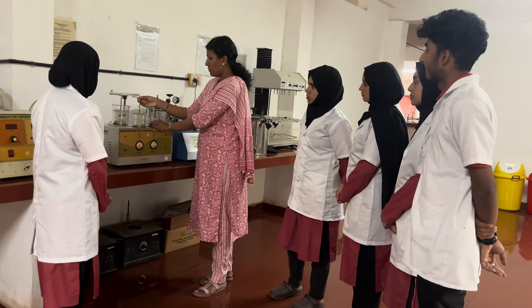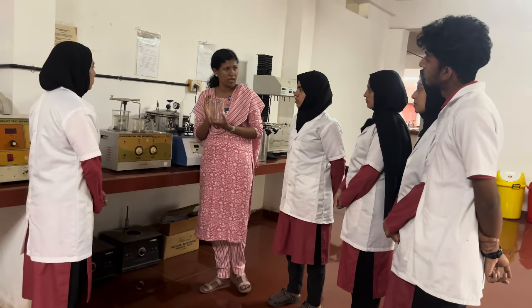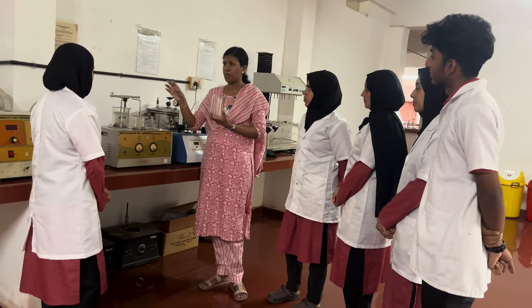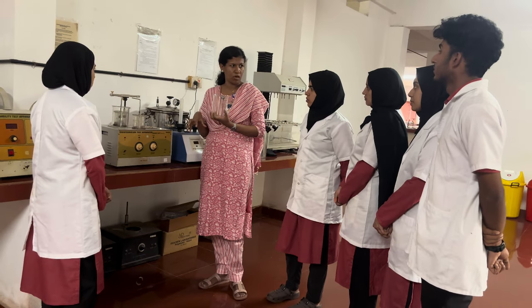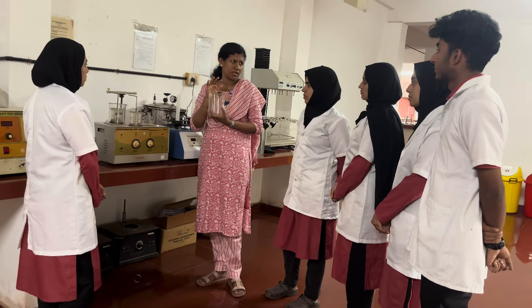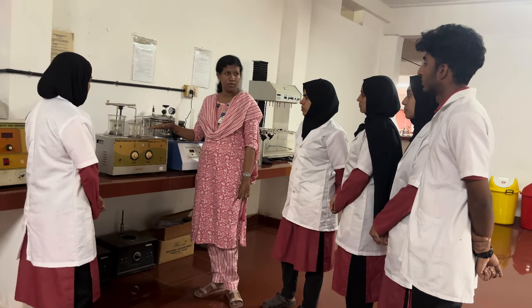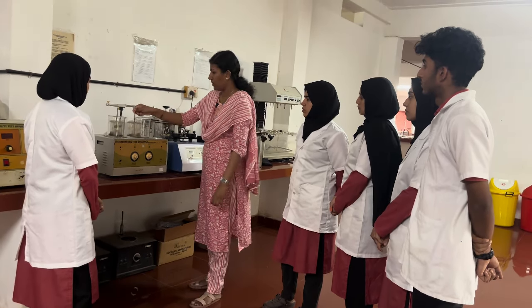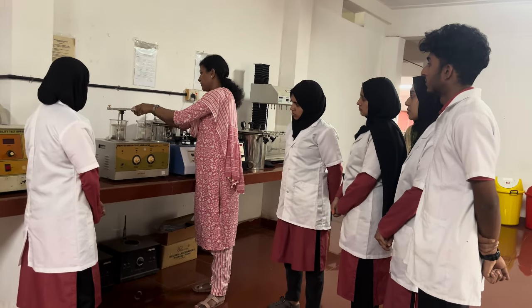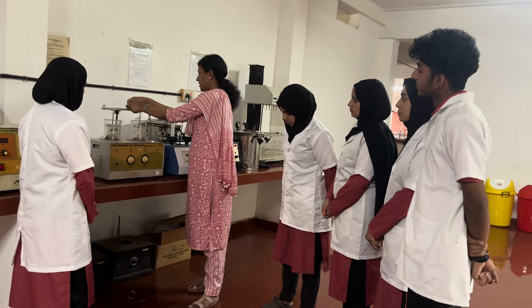So what is the first step of the procedure? We will fill the beaker with the medium, and this medium is described in the official Indian Pharmacopoeia. If we are assessing paracetamol tablet, we have to go through the monograph of paracetamol tablet. Then we will get the disintegration test and see which medium is used for it. Then we will take that volume of medium in the beaker, and we will place the basket rack assembly in position.